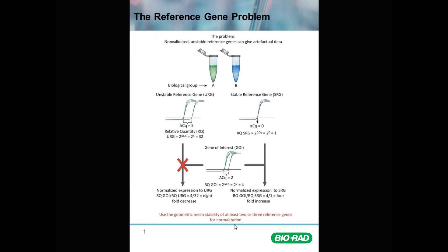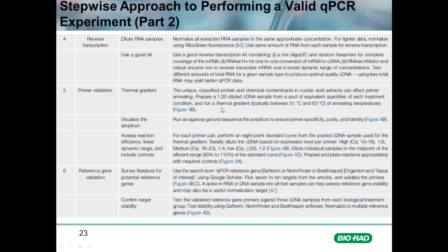In order to select a good stable reference gene or set of reference genes, there is a table in the article Trends in Biotechnology that describes how to do this. Step six of reference gene validation describes how to use a search term in Google Scholar: type 'qPCR reference gene' and either geNorm, NormFinder, or BestKeeper — the three commonly used software tools to assess reference gene stability between samples. Then type the organism and tissue of interest, and that will return published papers where authors used these tools to determine reference gene stability for your particular organism and tissue.